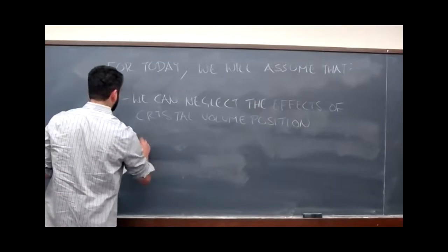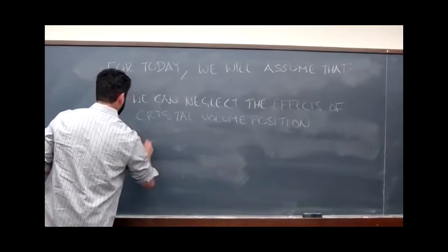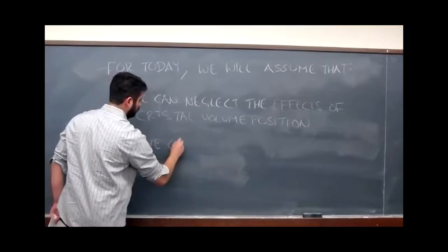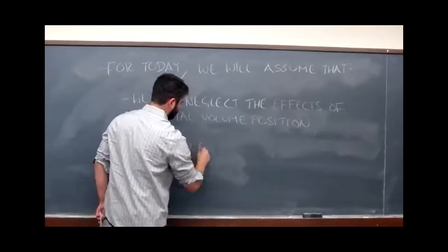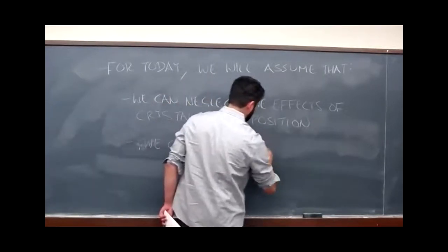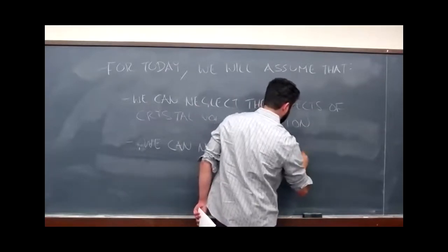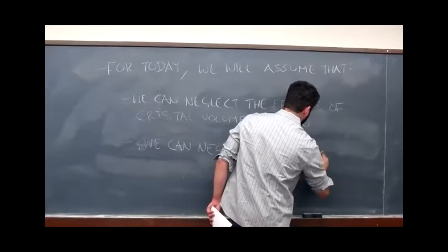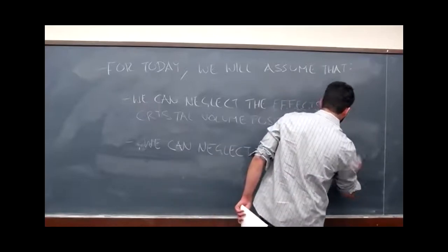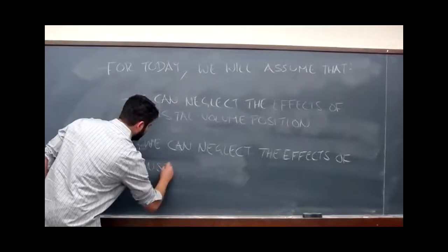and that we can neglect the effects of instrument broadening.